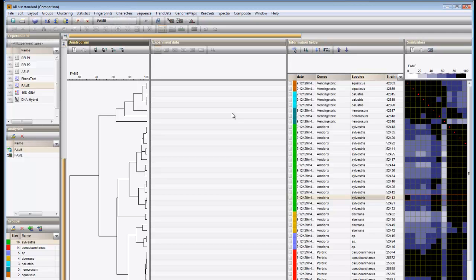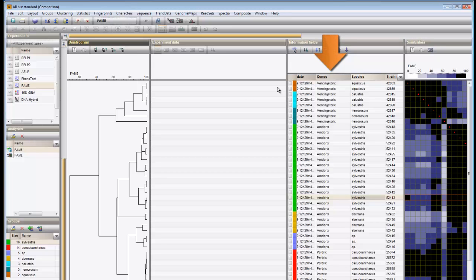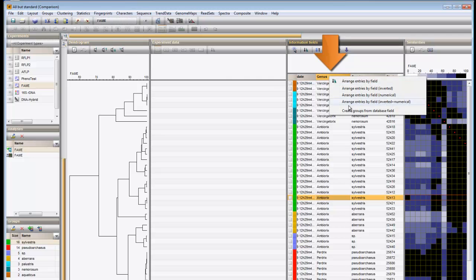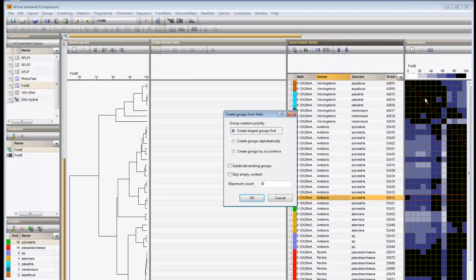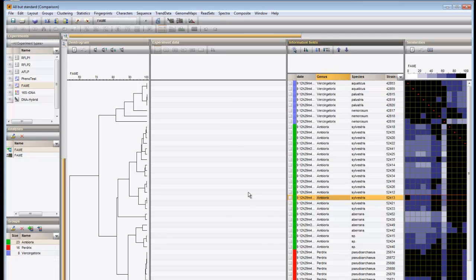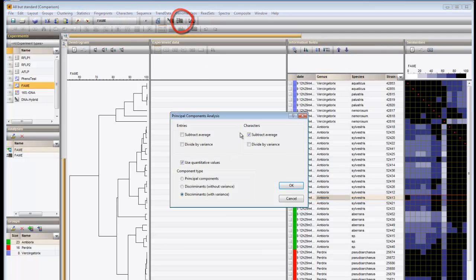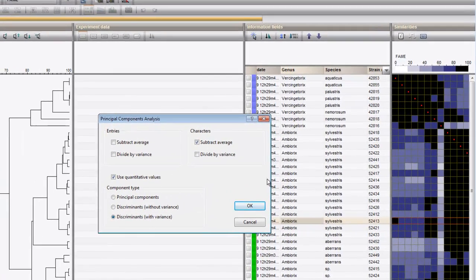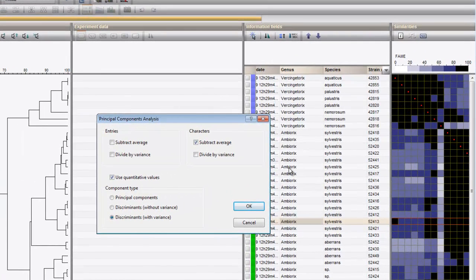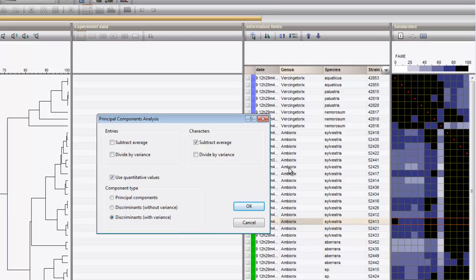Since discriminant analysis works on user-delineated groups, the comparison should contain groups. I will redefine the groups based on the genus. Call the PCA dialog box again with this button. As a component type, you have two options.